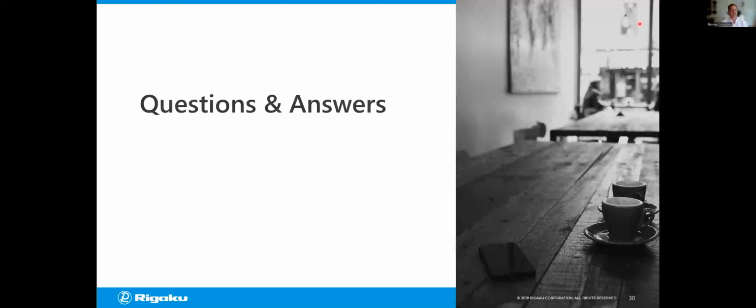So the next one is max and min measurable quantities. Have you tested those limits? Right. I haven't really tested the maximum amounts, but as you saw from the response plots for both of the mixture examples I gave you, they go up to 100%. But I haven't gone through and tried to pin down how close to 100% you can go.